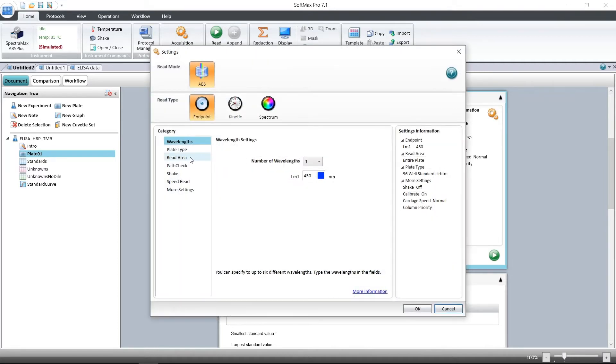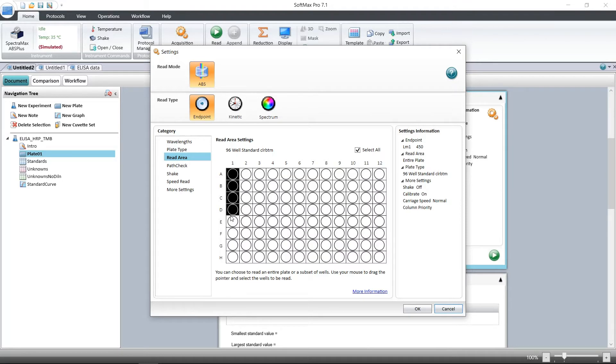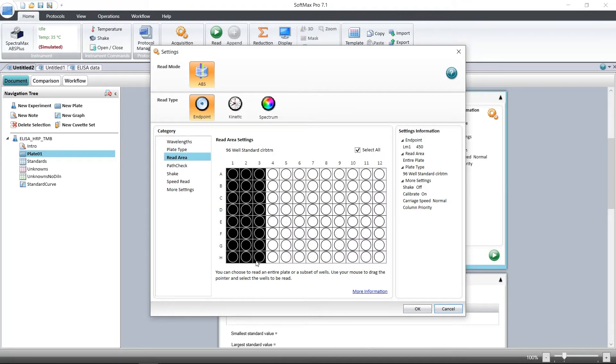As ELISAs are typically run in strips, you may want to change the read area so you can select the number of columns for the number of strips you're running. For this example, we'll select three strips and then click OK.